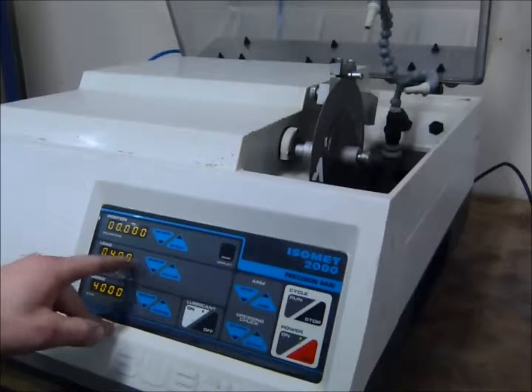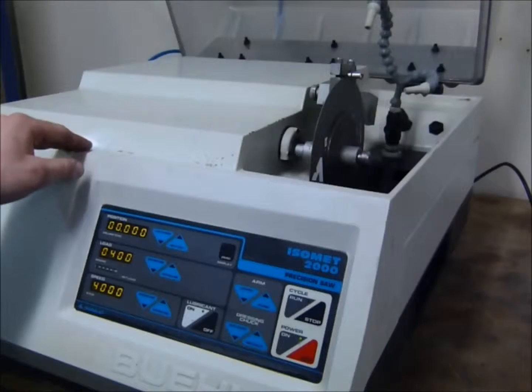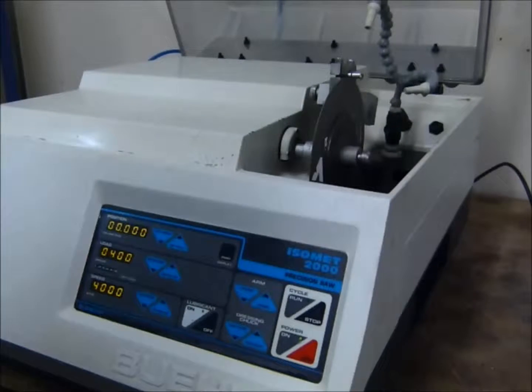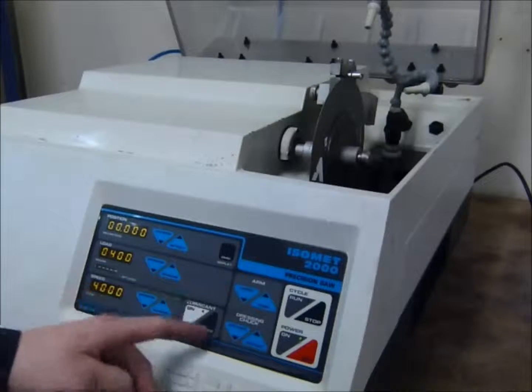You can select the amount of load you'd like to put — the force down when cutting. And you can set the speed at which the disc will spin. You've also got the option of lubrication on or off.